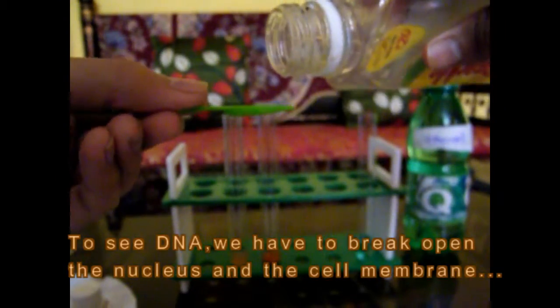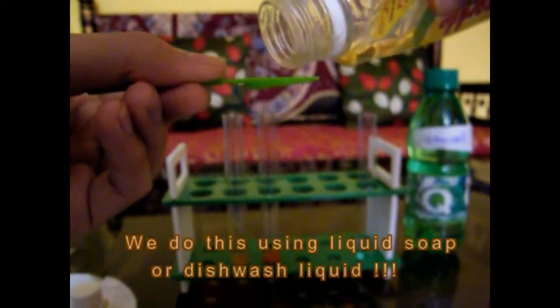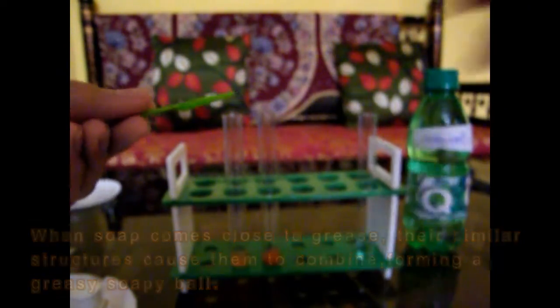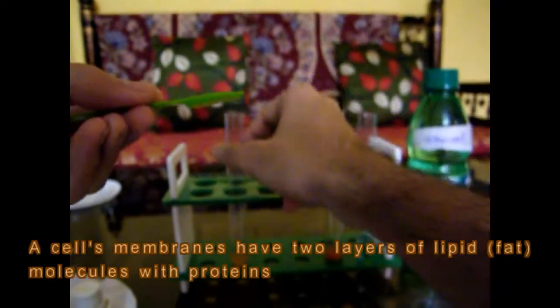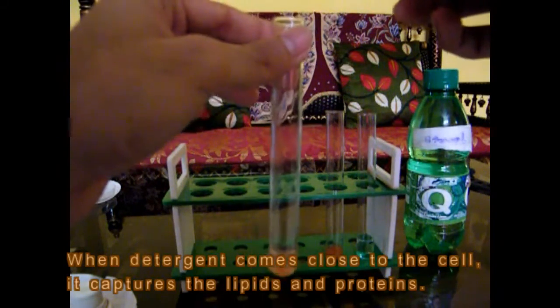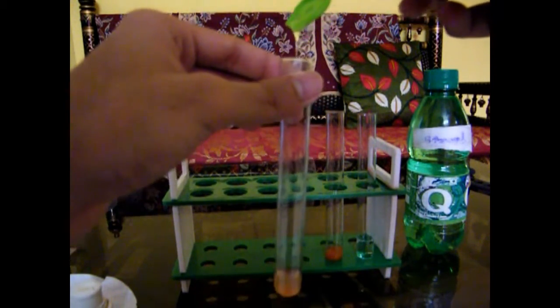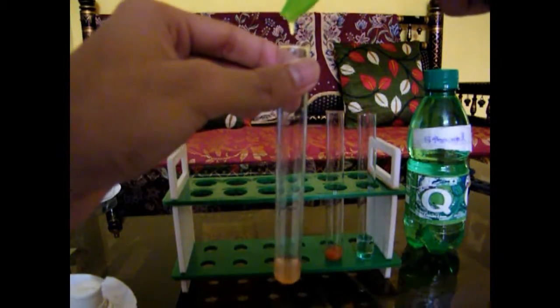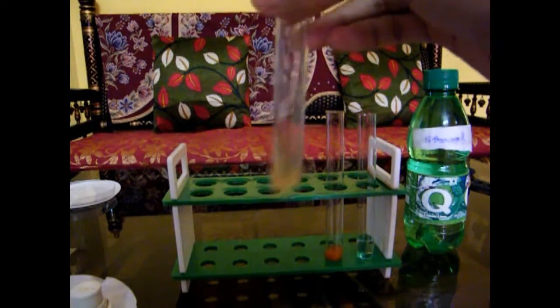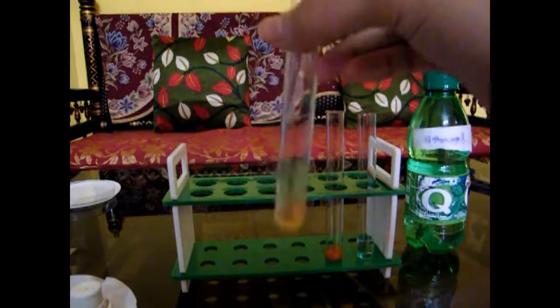Now what we will do is use dishwash liquid. Be careful not to use too much. I have taken the dishwash liquid and I'll drop it slowly — be careful while dropping it because you don't want it to run along the sides of the test tube. Now stir it gently; be careful not to over-stir and create bubbles. The solution is now ready.